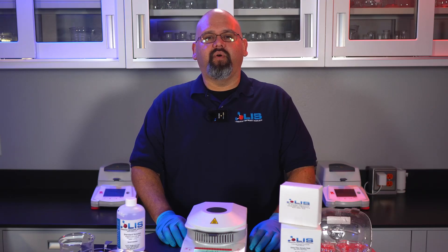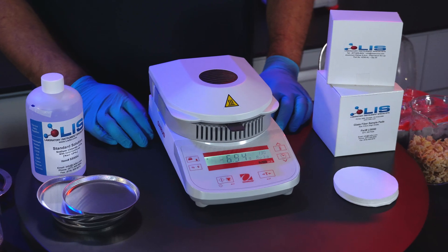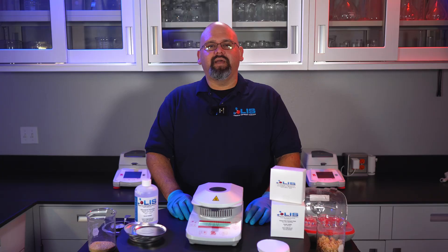In this video, I'll be doing an overview of the MB-23, giving you a list of important specs, as well as showing you how to properly calibrate the scale and temperature, and how to properly test both dry and liquid food samples.